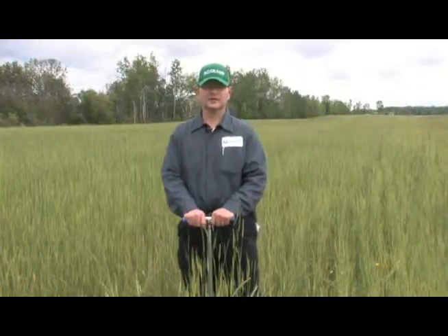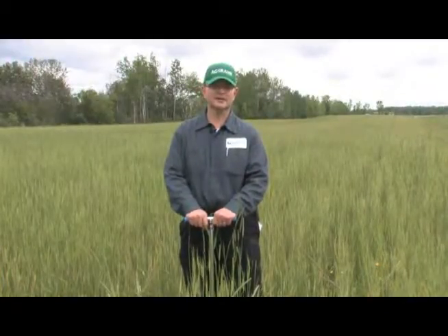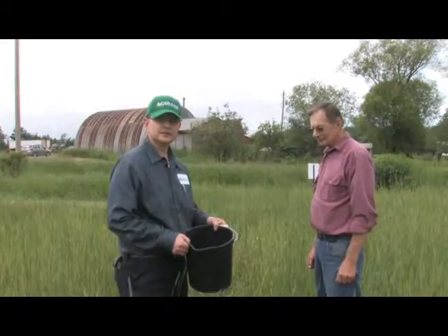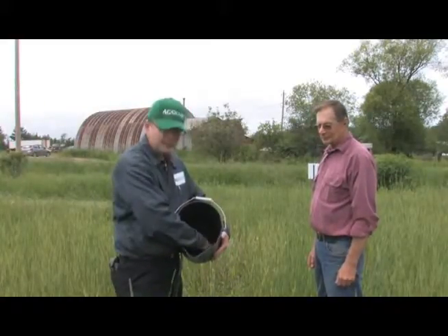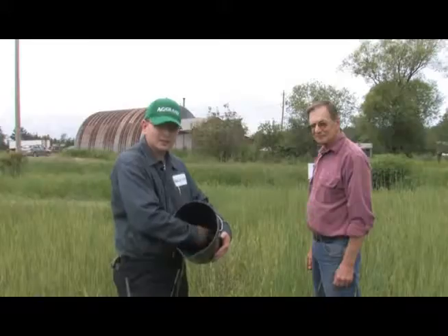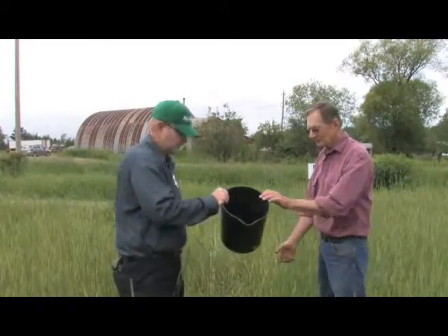Now that we've shown you how to take a soil sample, for the most accurate results, we recommend taking at least 15 points in a grid-like pattern. Once we obtain the 15 samples throughout the field, we take the soil samples and we put them in the bucket, and then we mix it very intimately around inside of here to get the best sample possible to be shipped to Midwest Labs.